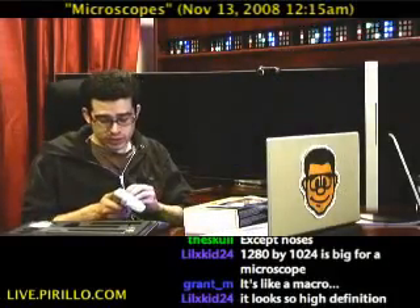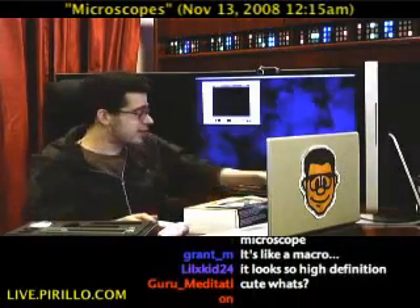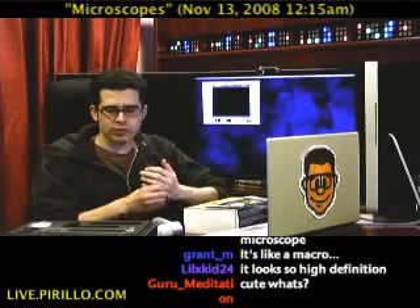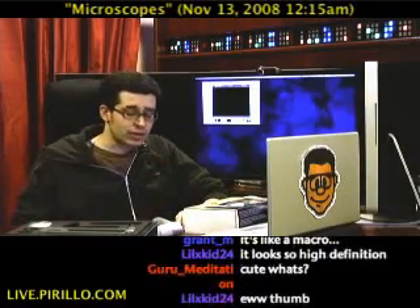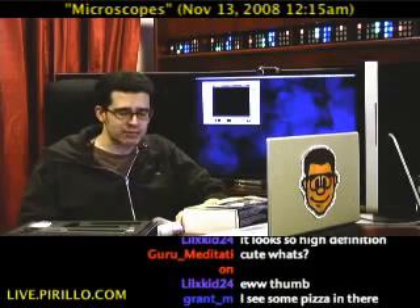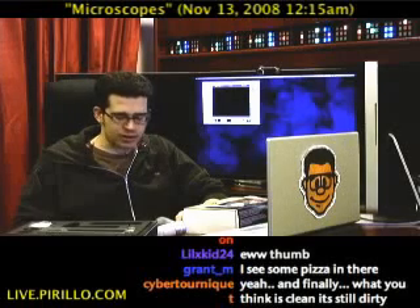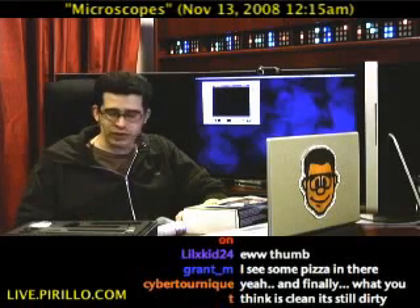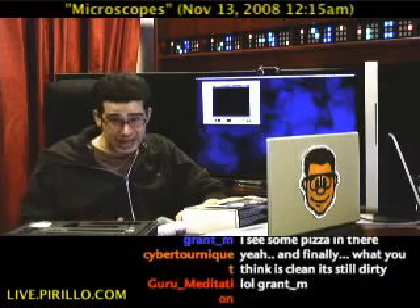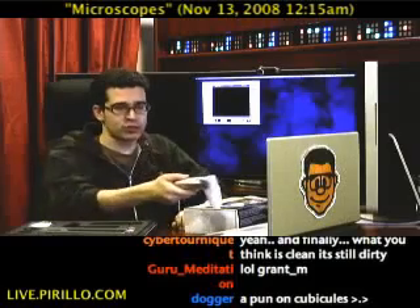Record stills, record movies, and certainly have tons of fun with the ProScope HR. I would say it's fun for kids and adults — it's likely going to be good for those of you who are scientifically minded, or if you wanted to learn about the things already around you just by looking at them through a different kind of lens. Certainly the ProScope HR will not disappoint. High resolution imagery, very responsive, didn't need to install any drivers. I could even mount this as a webcam if I wanted to, and just zoom in on something all day.